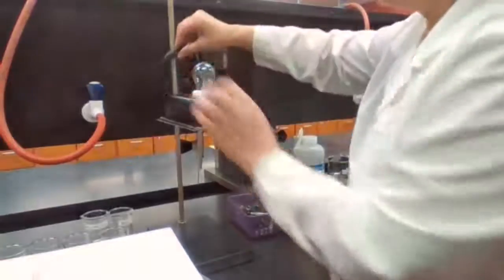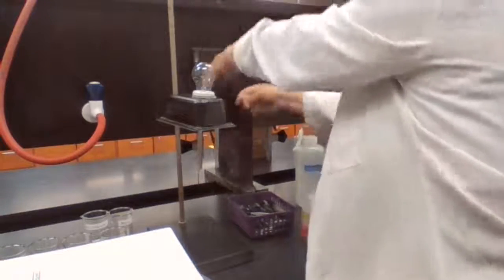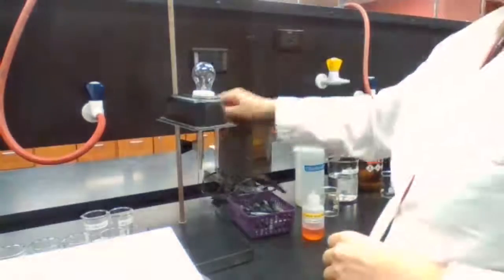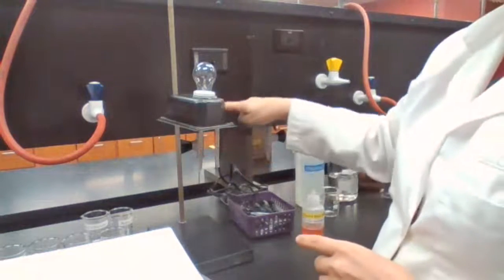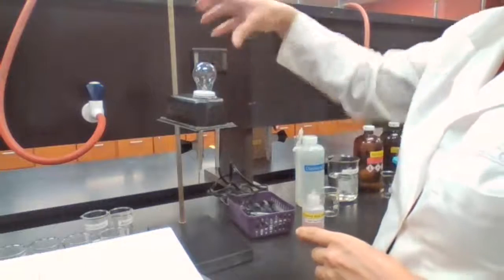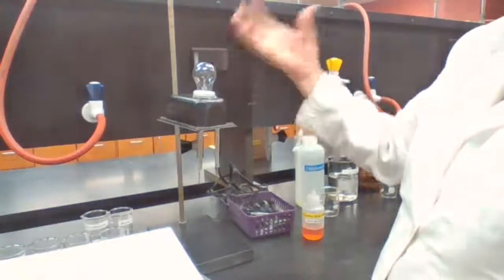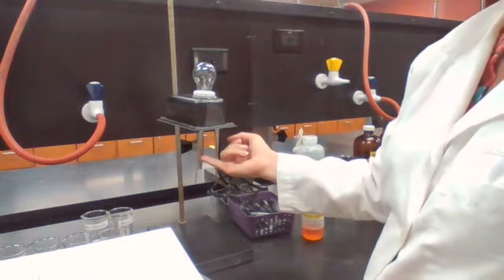The simple design of the conductometer is a light bulb. When you connect it to the power, the power comes in and separates to 2 poles. In order for the light bulb to light up, electrons must go from one pole to the other pole.